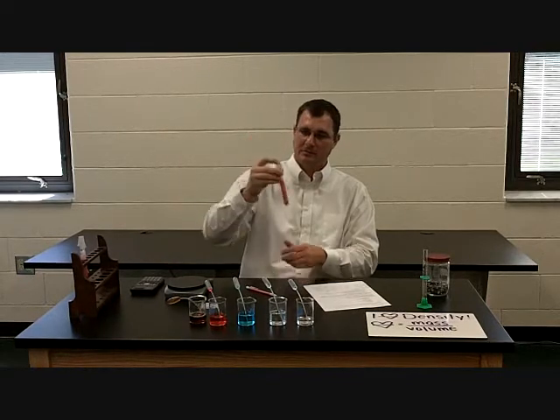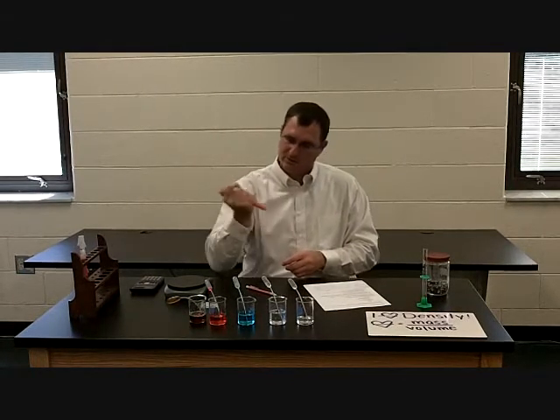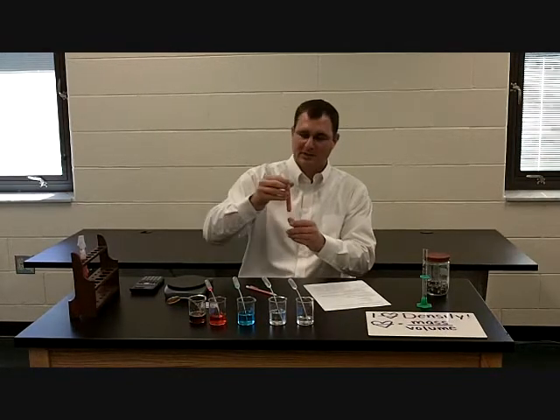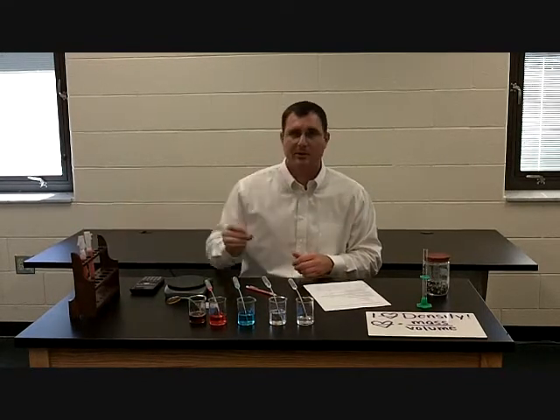All right. Let me try this a little bit more. It looks like my syrup, oh, it's so viscous it's even hard to get to mix in there. But I've got this nice mush in there. Now the question is, if we let that settle, what's going to happen? Are they going to go back to their nice separate layers, or are they going to stay like that?